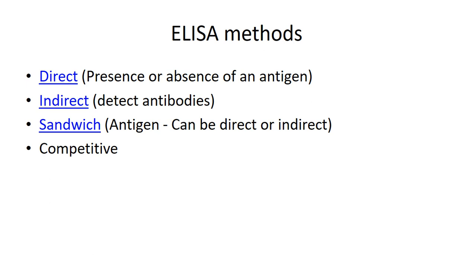A sandwich ELISA is used to detect antigen, generally speaking. It can be direct or indirect, and we'll cover that. And lastly, you can have a competitive ELISA.